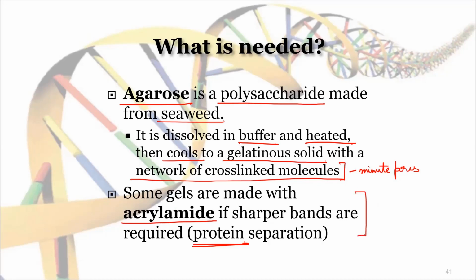You can remember we call this one AGE, agarose gel electrophoresis. This is called polyacrylamide gel electrophoresis, or PAGE. This is mainly used for protein separation.